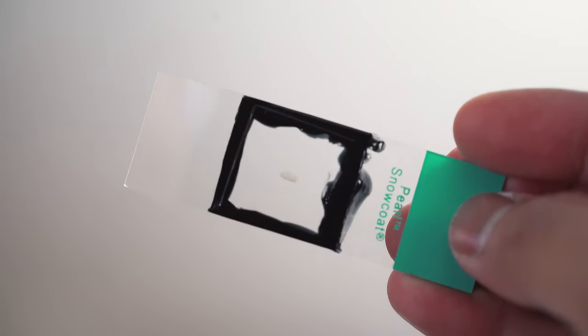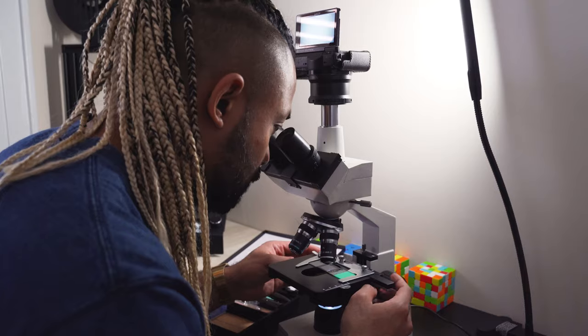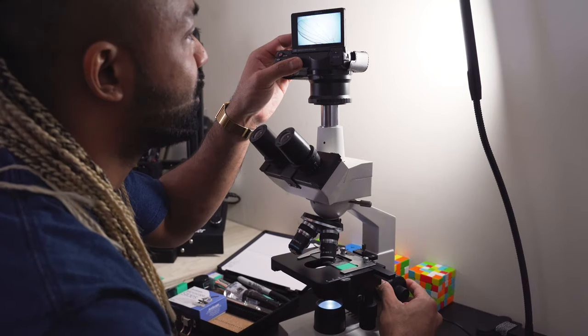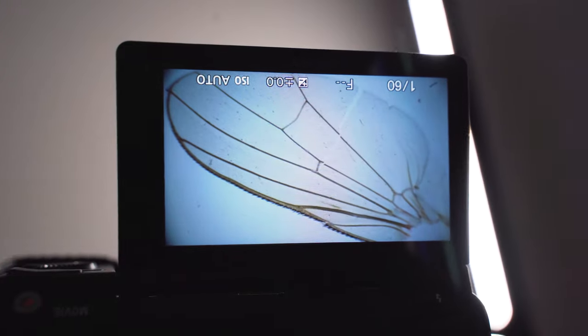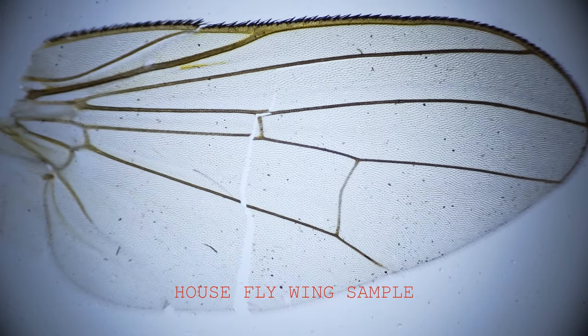This is a little sample that I got from a fly that came to my crib. I'm gonna put the sample here. Yeah, make some adjustments. Let's focus it. Oh shit. Check that out. Look at that little housefly wing. Let me show you on the bigger screen. Look at that housefly wing.